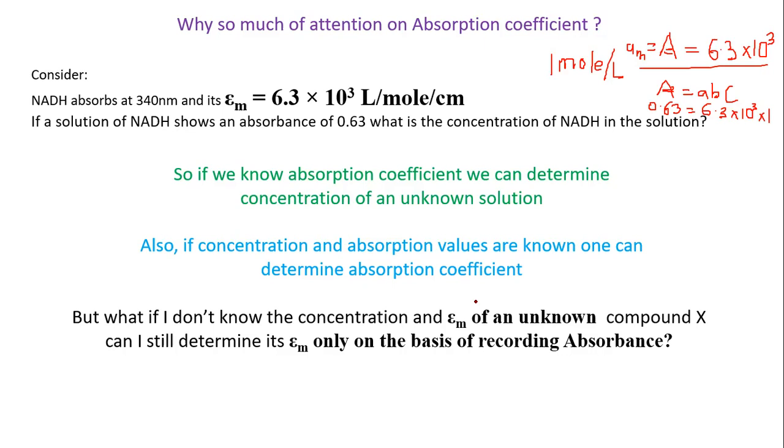To prepare a range of standards, you should have a standard concentration known to you, correct? Yes, sir. So can you do that now? And don't forget the task. The task is to find out molar absorption coefficient, okay?